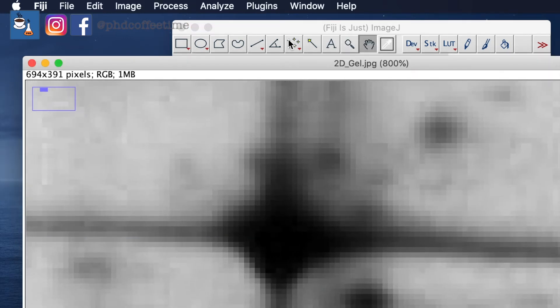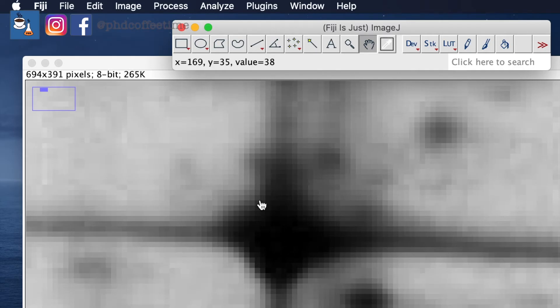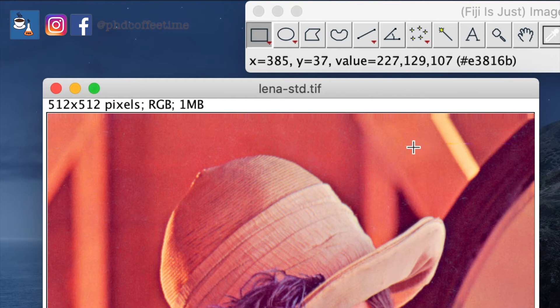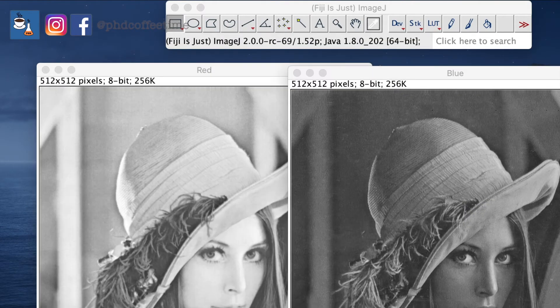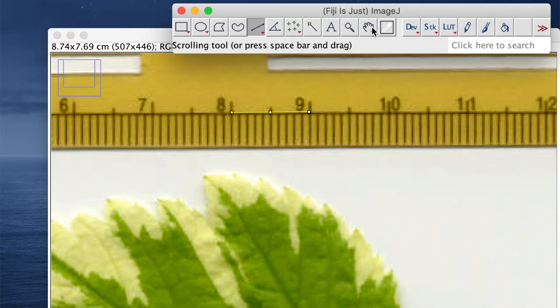Let me take you over to ImageJ. If you magnify an image you can see the individual pixels, and placing your cursor on a pixel shows its brightness value — how full that bucket is — from 0 to 255. Mathematically, every pixel can be replaced with a number. For color images, there are three sets of values using red, green, and blue. For microscopy images, some software includes calibration telling you how many pixels equal how many micrometers. In real life, you can stand next to a ruler, take a photo, and calculate lengths from that image.